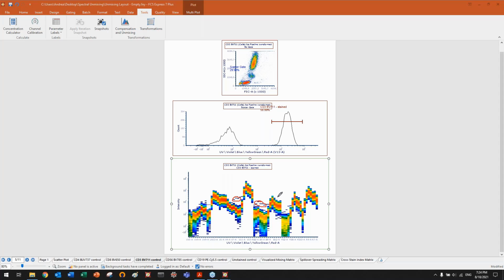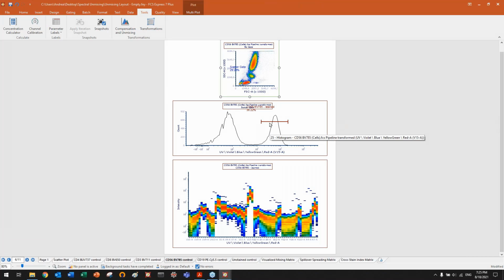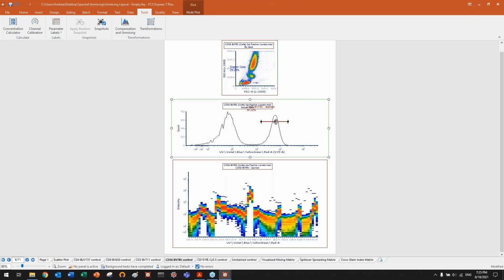You might not be super afraid of this because anyway, we are measuring here the median or the average, I mean, a central tendency. So one single event will not make much difference. I should check later on. It should be the median of every single detector. Okay, so CD56, let me clean a little bit my monitor. Scatter gate, my peak, okay, you see it's live updating.